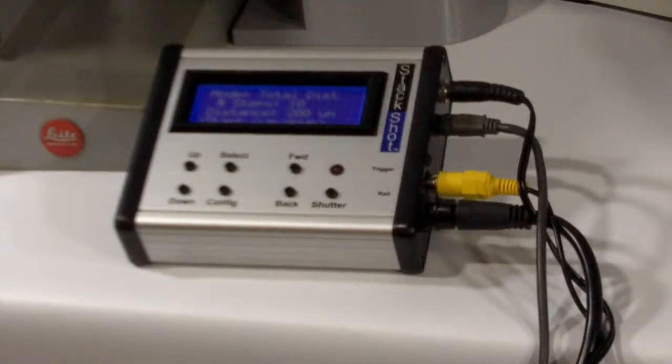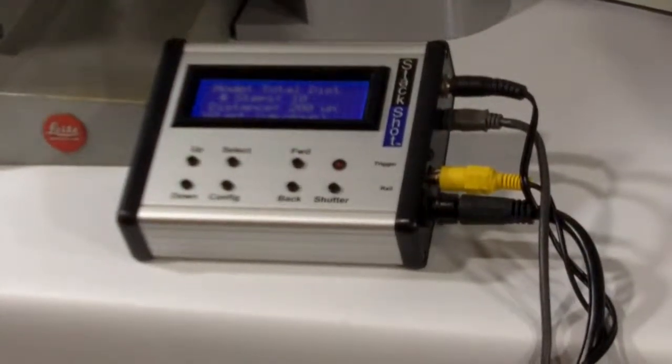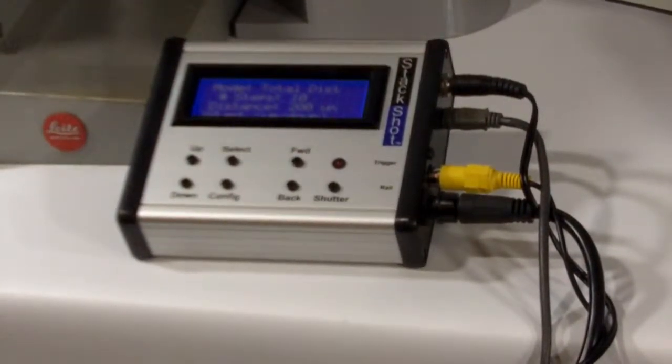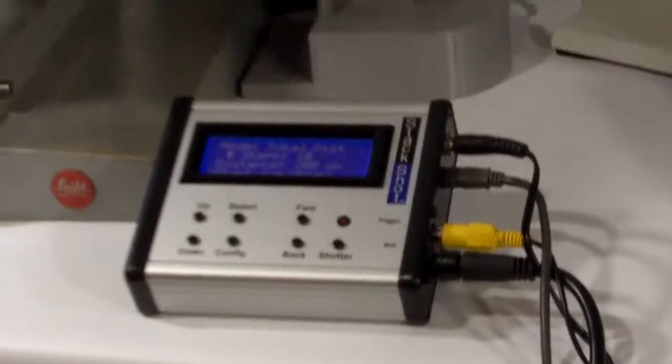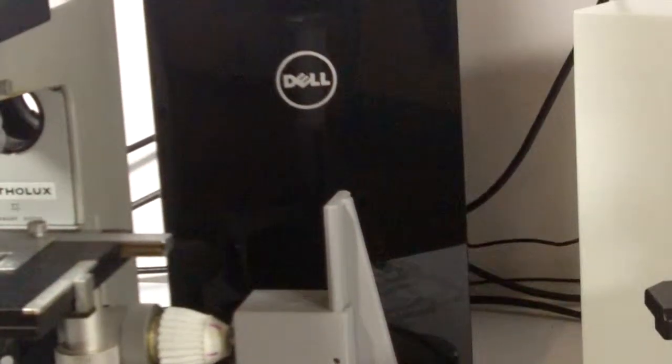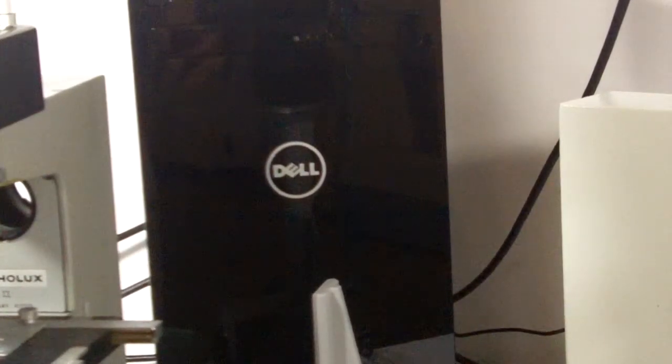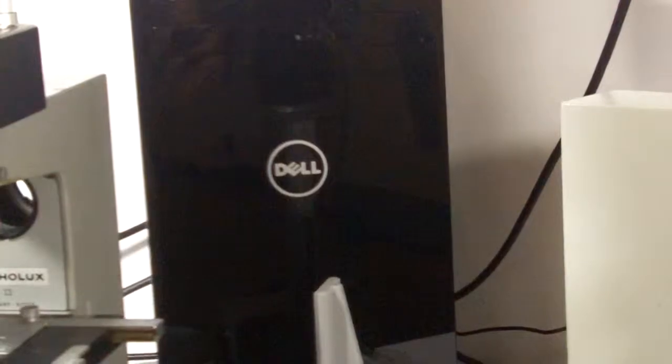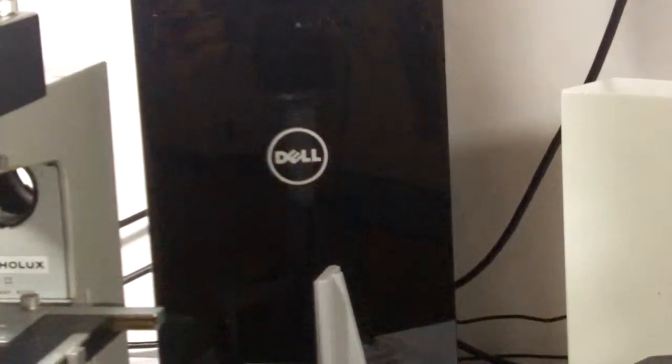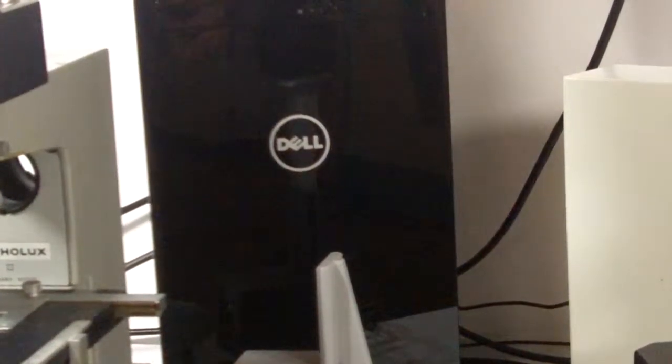The other one you see there is the cable going to the computer. So the real key component for stack shooting is a Windows operating system computer. We just happen to use the Dell, and we sell that Dell system for those who need a complete turnkey package.